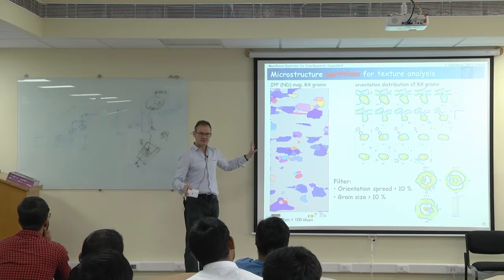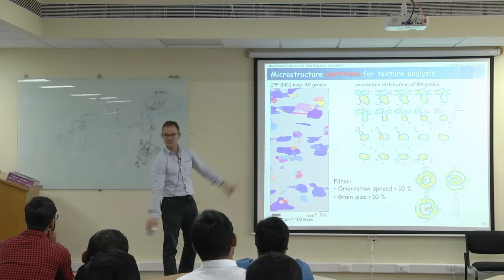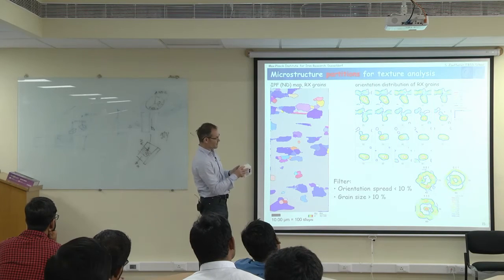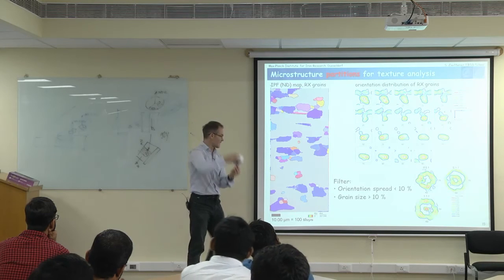And I would go and measure at least one more map at a different corner of the total sample and see whether it comes out the same. But the principal thing we see is this 1 1 1 corner standing of the grains.